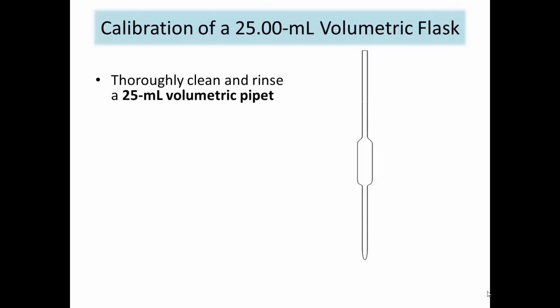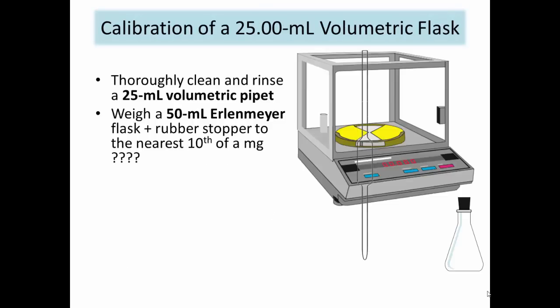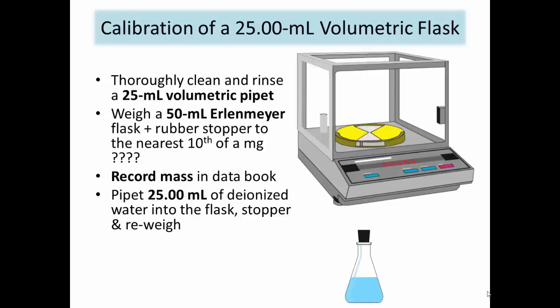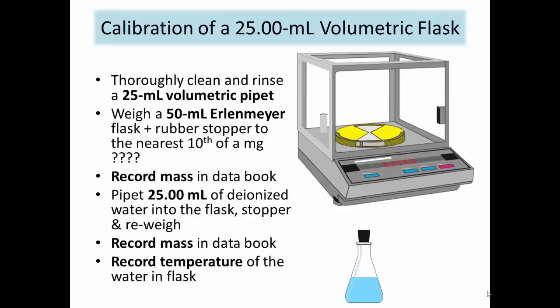Calibration of a 25 ml volumetric pipette is performed similarly. First, thoroughly clean and rinse a 25 ml volumetric transfer pipette. Then, on an analytical balance, weigh and record the mass of a 125 ml Erlenmeyer flask and stopper. If using the same Erlenmeyer flask as before, weigh it again before starting this part of the experiment. Pipette 25 ml of water into the flask using the volumetric transfer pipette. Stopper and re-weigh the flask on the same balance. Record the mass of the flask, stopper, and water, and record the temperature of the water in the flask.